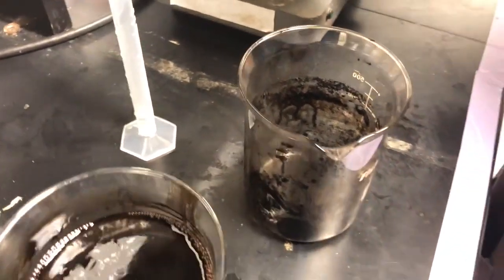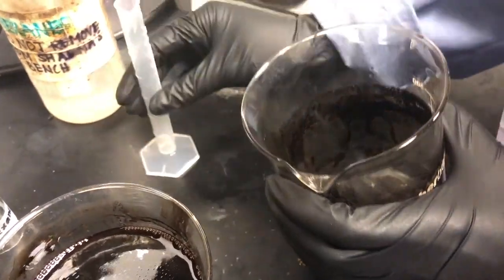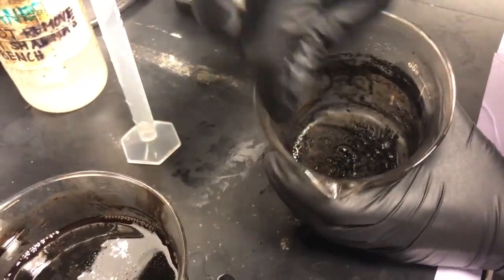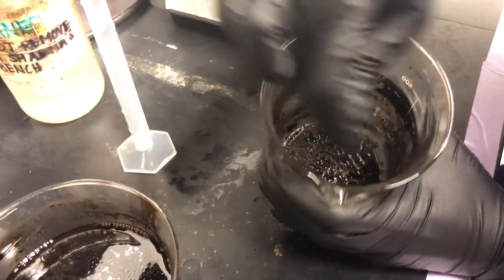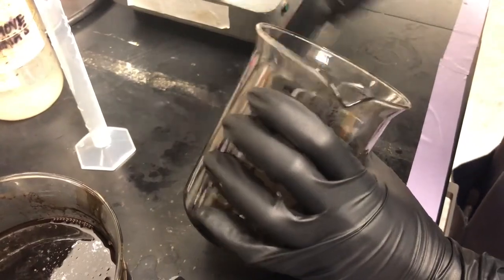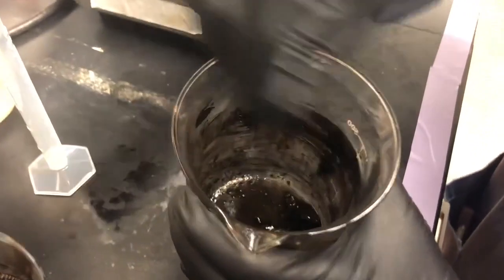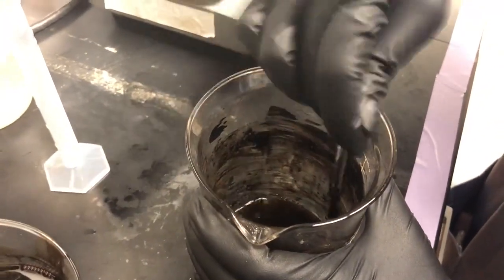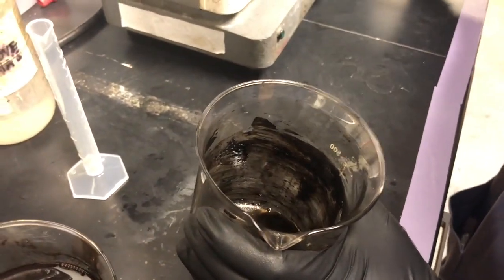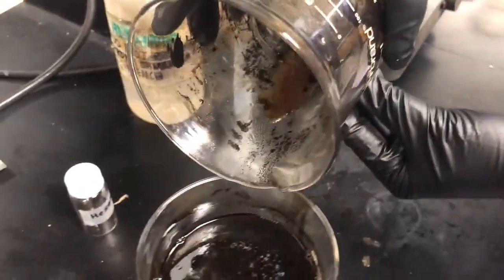So at this point, we're going to do a few more washes with hexane. Each time you should be removing more and more ethanol. Now hopefully there's no more water left over. If you do see any water, it'll come out as little white droplets that are separated from the black liquid. If that's the case, you might need to go back to an ethanol wash step, but hopefully you do not encounter that.